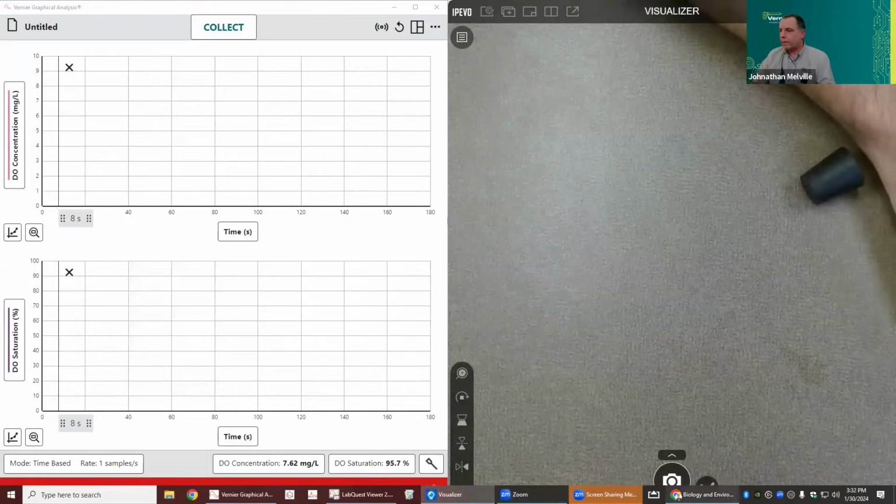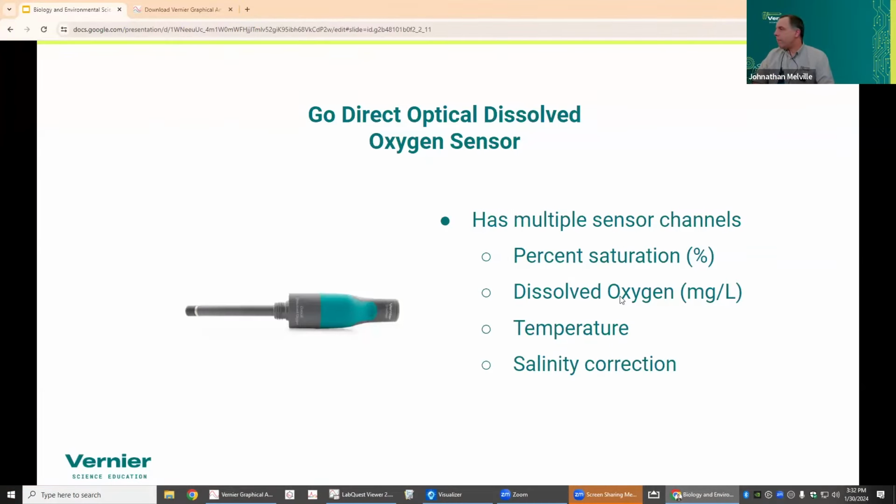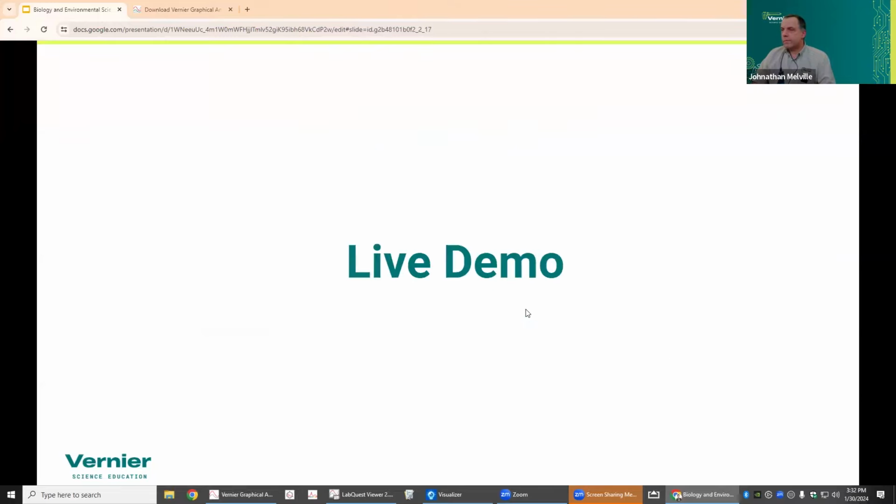All right, let's go back to the presentation here. Other questions? These are all great presentations, great questions, by the way. Thank you so much for asking. All right, and I did the live demo. All right, so that's a good question.